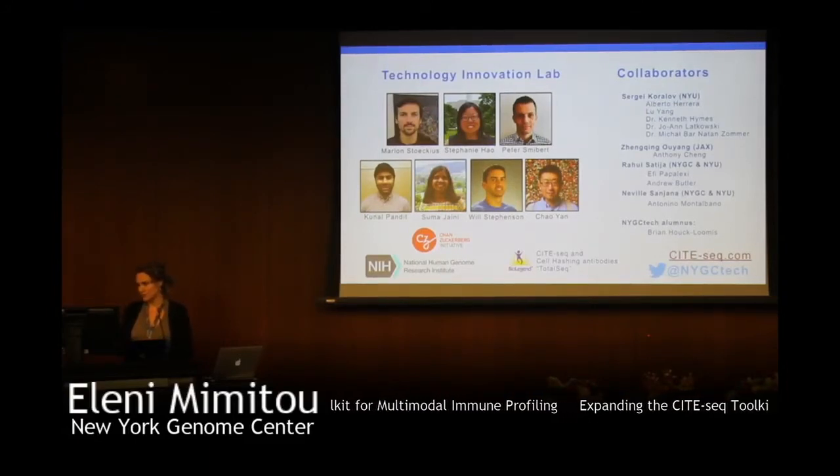If you could do CITE-seq with the antibodies, those markers, and do everything well, that's the experiment I'm doing almost right now. But I'll be happy to do it at a much bigger scale. The guides I have now are about 20. If you go into hundreds, I would be very interested to try.